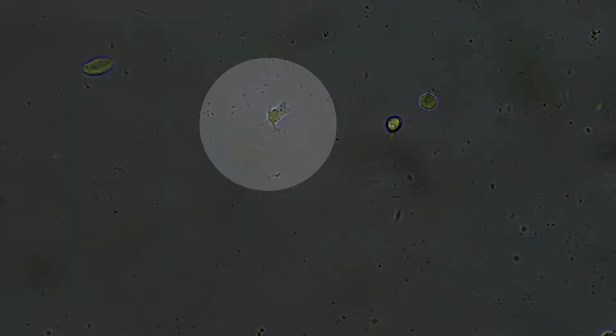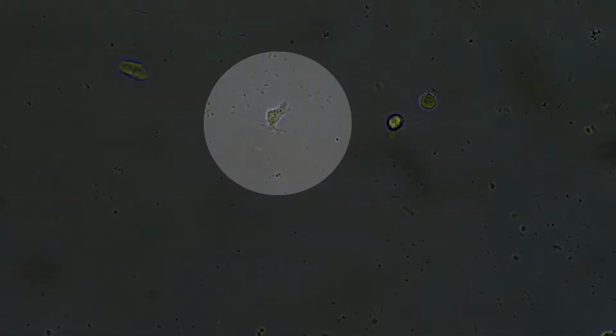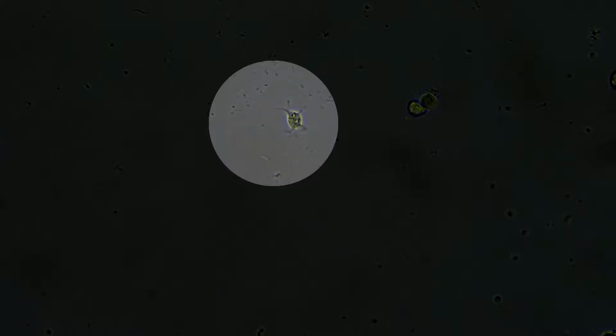Another way to identify them is this, they have a prominent nucleolus. So there's like a little halo around, their nucleus looks like a dot with a halo around it. And I think that's what I'm seeing here. But these guys are so tiny, they're kind of at the edge of what the particular scope that I was using here can handle. And so I didn't get a lot of detail on their nucleus and their nucleolus. It's really hard for me to tell without more detail than this whether I'm looking at maybe it's a food vacuole. I don't know.